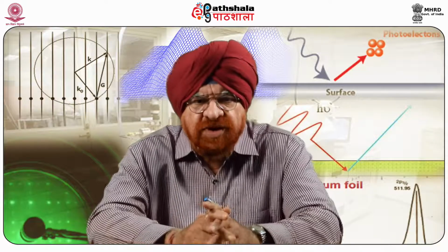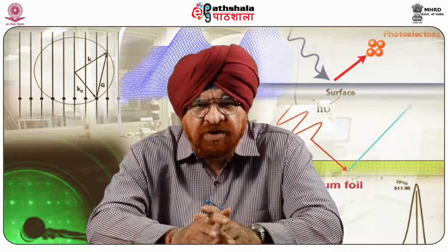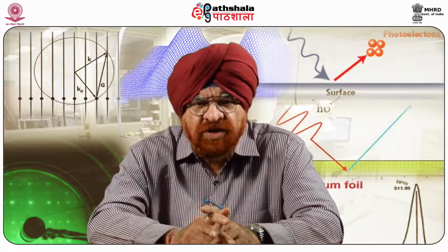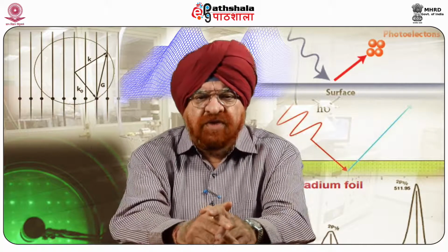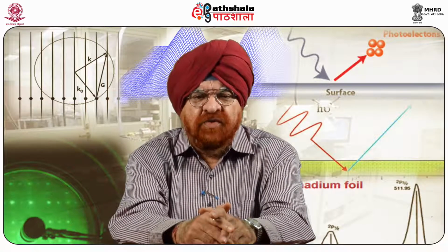So the question which arises is, why study SPM? The SPM technique images the surface structure with atomic height resolution without the necessity of damaging the sample. The results are shown as a kind of three-dimensional image. SPM operates without vacuum, and in contrast to electron and optical microscopes, it can measure different other physical properties.